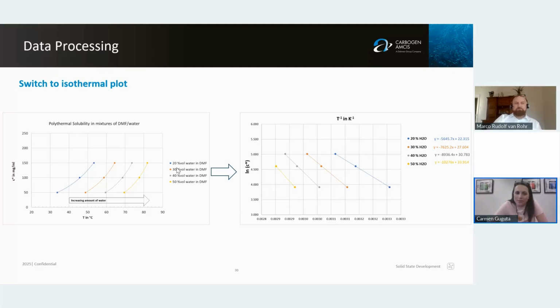In the first example, has your team tried other solvents apart from DMF? Sometimes acetonitrile can be as good as DMF, and it's a bit less costly. Maybe in the past we could have tested that. The thing is that there were tests for the reaction, and DMF was considered the best and was not changed. And this process is validated.